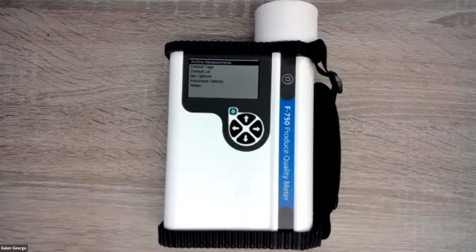It's a great feature, and it helps keep data organized. At the minimum, at the end of every day, just archive your measurements. It'll store them all in the same folder, so you know this day's measurements were in this specific folder. It helps with organization and with not overcrowding your SD card.